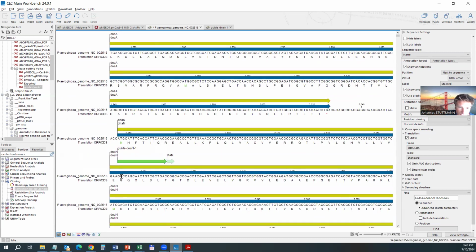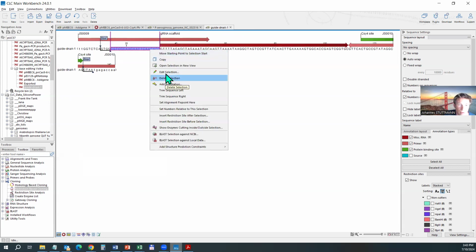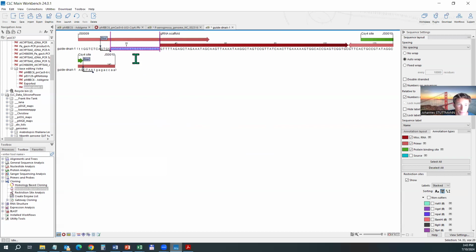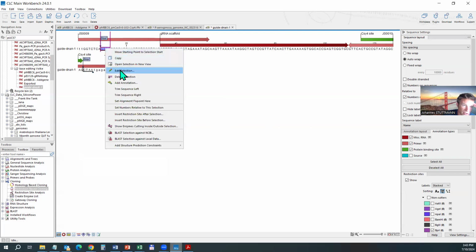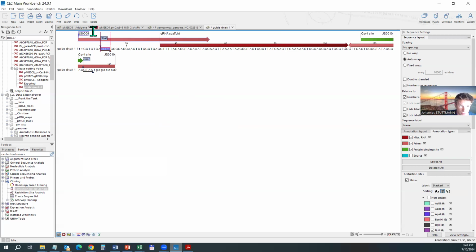And what we have now, I don't need to do much. Oops, wrong thing to do. I basically have to change this for these 20 nucleotides from the other gene. I have to change the overhang. So it now has to fit to the 3' overhang of the first PCR product. So this has to become a CTAA. Taking small letters. And now this will not be primer number 9, it will be number 11.